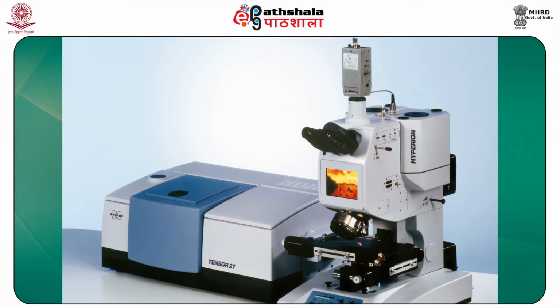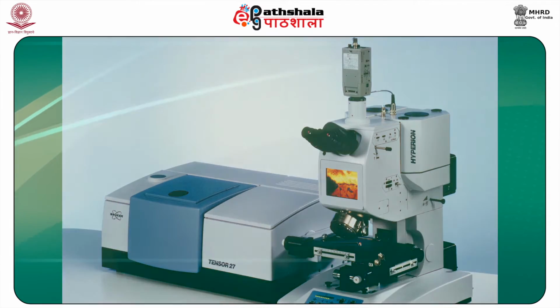The spectrometer in a FTIR at the same time collects the spectral data over a wide range. This property has an added advantage over the dispersive spectrometer because it measures the intensity over a narrow wavelength range at a specific time. Today, the dispersive infrared spectrometers have become obsolete and have been taken over by FTIR, thereby opening up new applications of spectroscopy. To convert the raw data into an actual spectrum, Fourier transformation is needed and hence the name Fourier transform infrared spectroscopy.